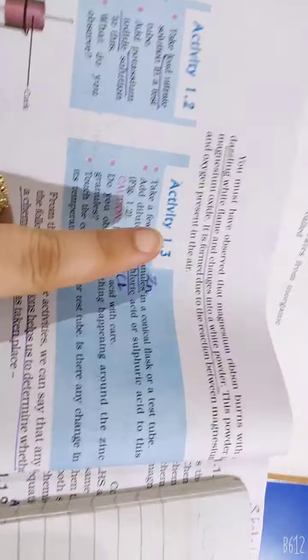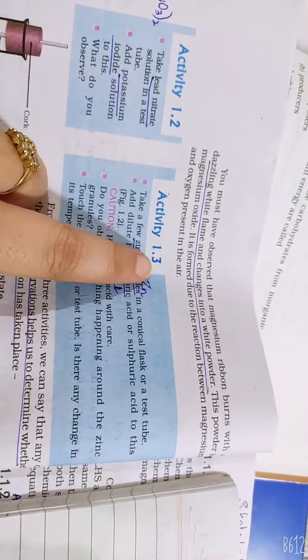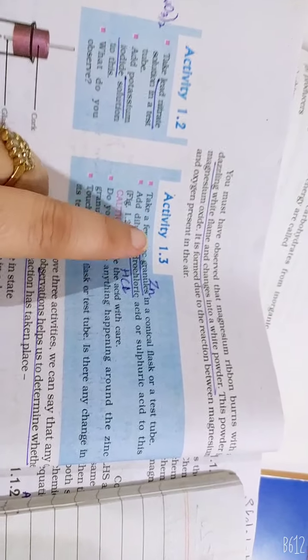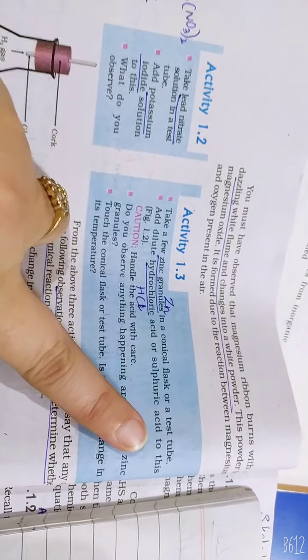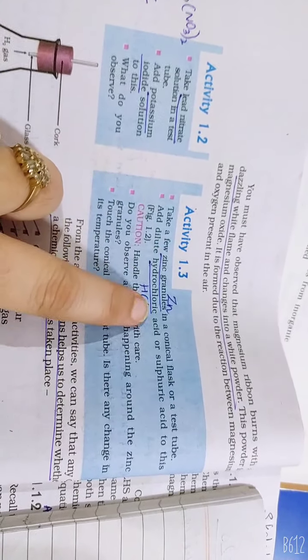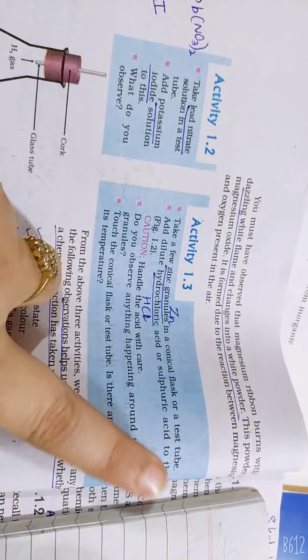Hello class 10. Today we are going to start Activity 1.3. Take a few zinc granules in a conical flask or a test tube. Add dilute hydrochloric acid or sulfuric acid to it.